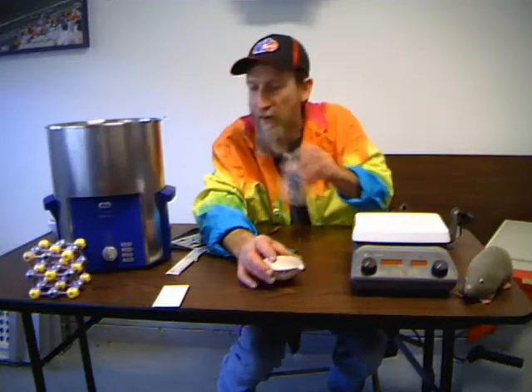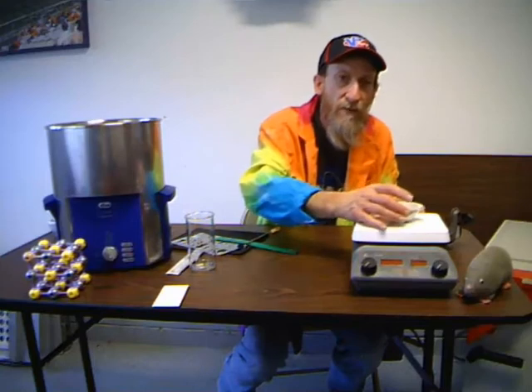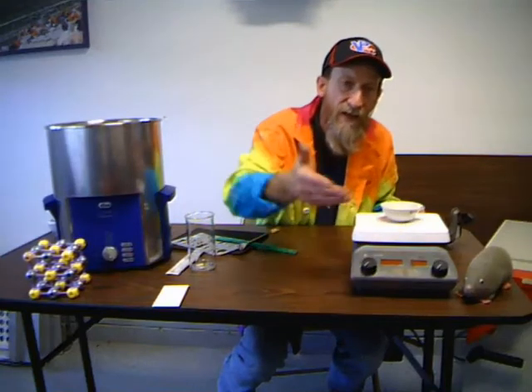The evaporating dish is designed to be very high heat tolerant, so we can put it on the hot plate and it's not going to break or crack. If we add water to it and want to evaporate it off, we can put it on the hot plate, turn the hot plate on, and evaporate it away.